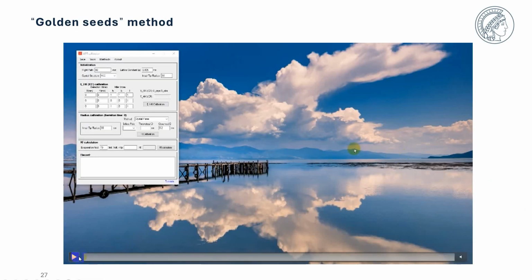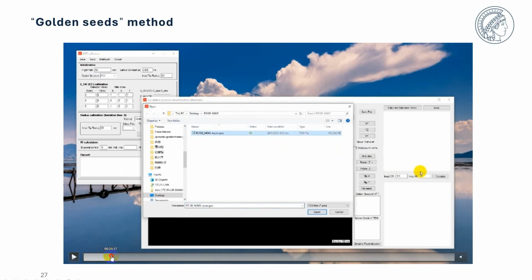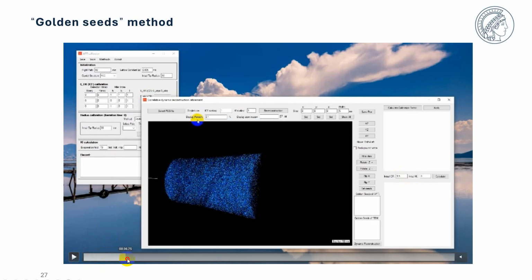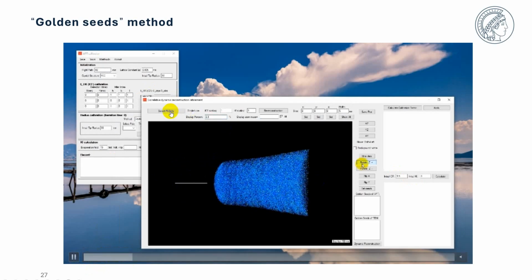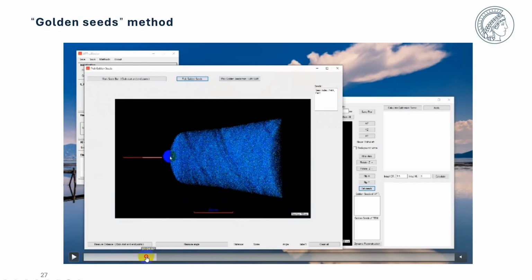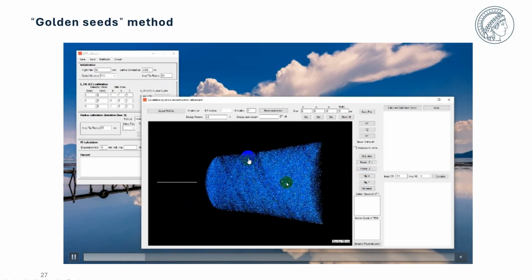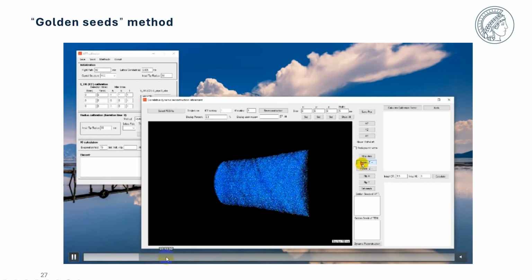Okay, here I show in the software how we use the function. So here we can just open the window for doing the reconstruction. Select the POS file, then it can give you a visualization of your sample. Then we rotate to make this edge very clear.